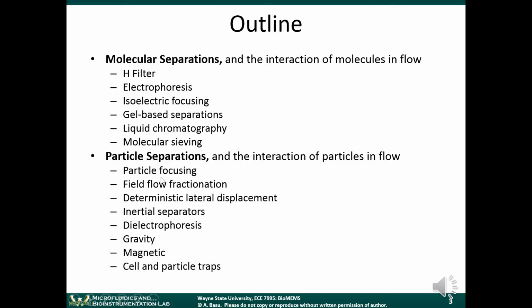separations. So the goal of molecular separations is to take a mixture of different molecules that are dissolved in the sample and to separate them out and to be able to quantify each one separately. If you had a mixture of A, B, and C proteins, for example, you would separate those proteins from the mixture, separate them out in time. Usually this is done by putting the mixture of chemicals through some type of chromatography or electrophoresis system where it comes out the other end at different times, depending on the rate at which it goes through the separation system. And then there's a quantification step.